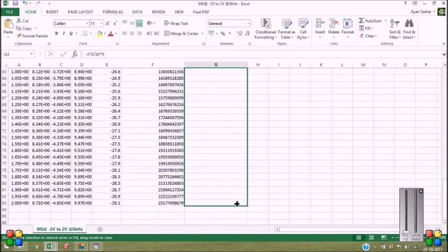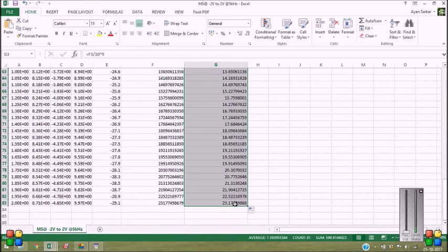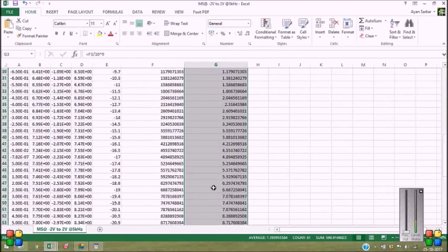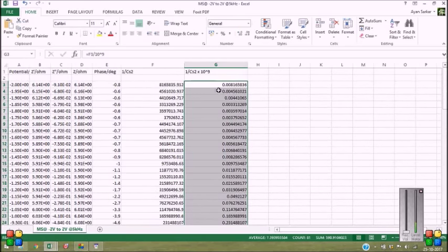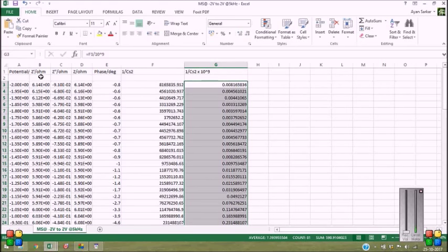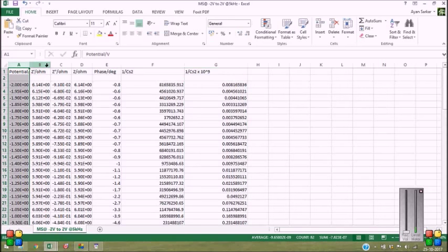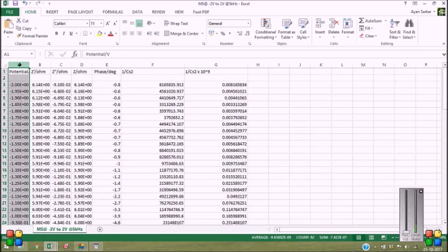Yeah, fine. I have obtained the 1 by Cs square value times 10 to the power 9 obviously. And I shall use this column A and column G for getting the Mott-Schottky plot in Origin.